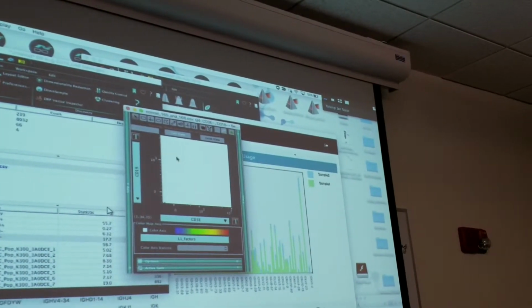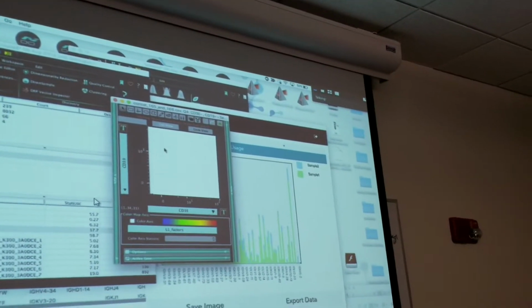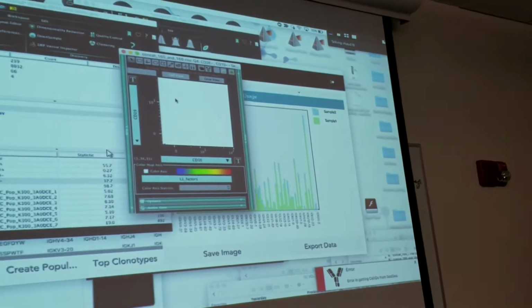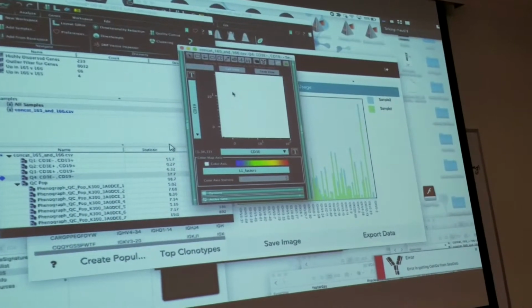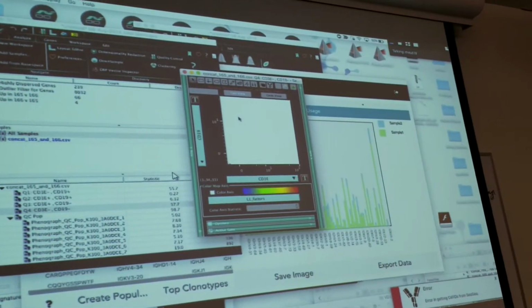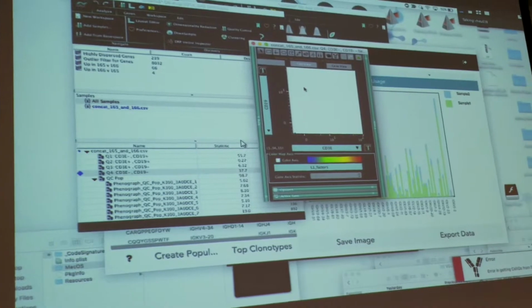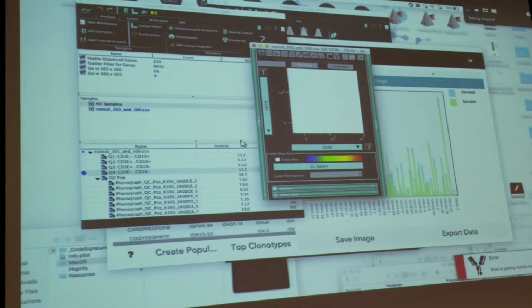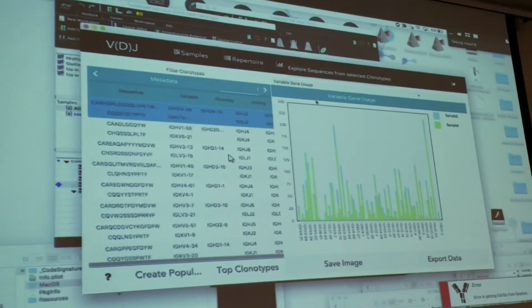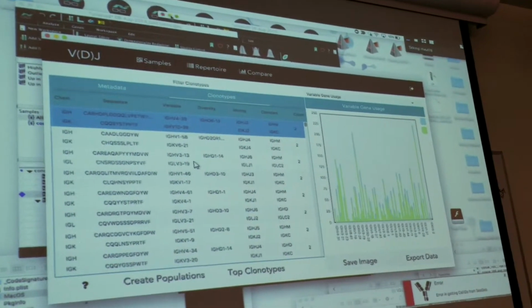That's kind of why we didn't just include the meta information in new parameters. Well, maybe I can say it like this too. Another way to say it is, what we want to do is identify maybe 5 or 10 heavy and light chain cells, based on something. It could be expression of interferon genes or interferon response genes. But we want to identify a group of cells in one person.